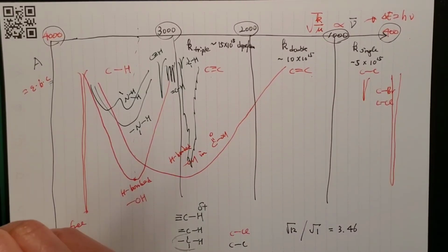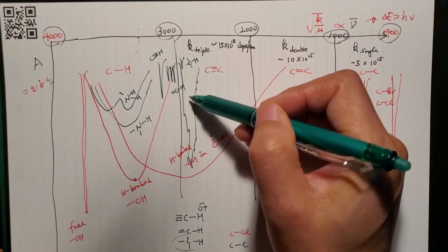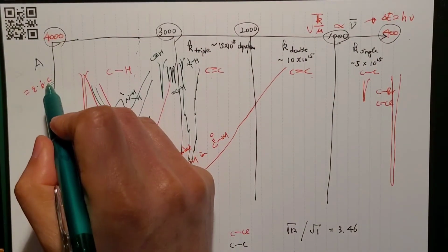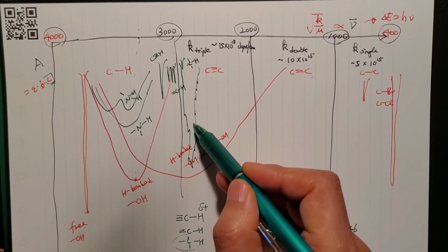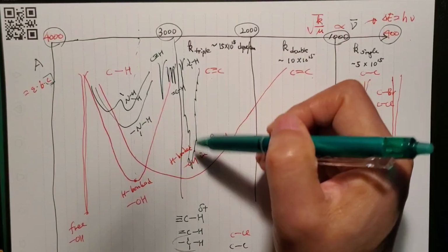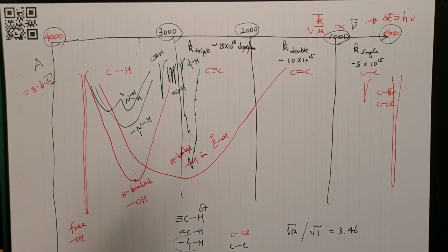So the concentration of the specific functional group makes the intensity of the particular signal greater. You can consider that the concentration of the functional group equals the concentration of the molecule multiplied by the number of the functional group within the molecule. Then you expect this to be much greater than the usual intensity considering its size.